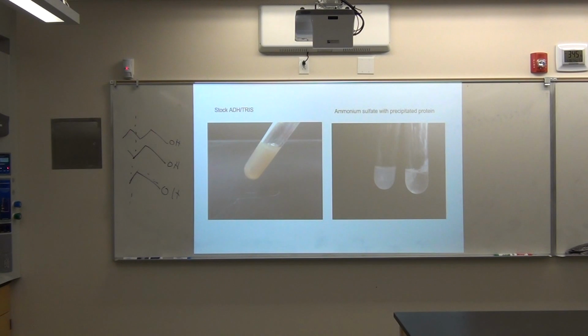You mean an aggregation of the proteins like this? Yeah, the aggregation, so the protein would be suspended in the solution, and then we centrifuge and add the salt solution again, and then centrifuge and take the precipitant out. We even went through the process of adding solid salt in there to see if we could precipitate it at a faster rate. Does the G-force on that do anything to the conformation of the protein? No, just temperature. That's why we have to.